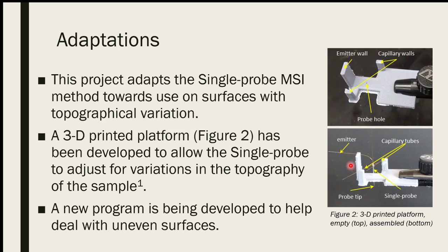But in terms of tissue samples, those can sometimes have a great deal of variation within the topography of the sample, and that can wreak havoc if it isn't dealt with in preparation. This would eliminate some of that need for preparation, and it could possibly be prepared incorrectly and still cause problems. Oh, absolutely. So this would be great for tissue sampling, as well as certain forensic applications.